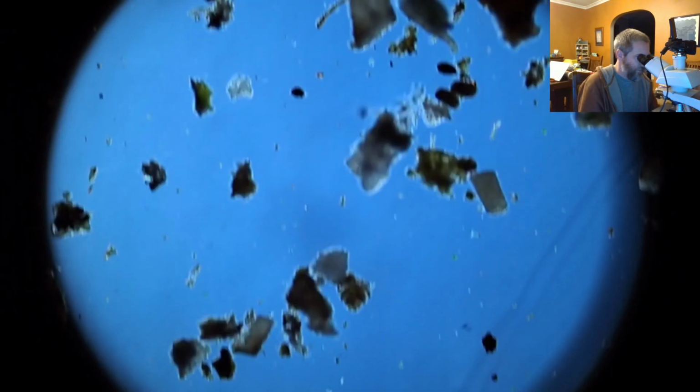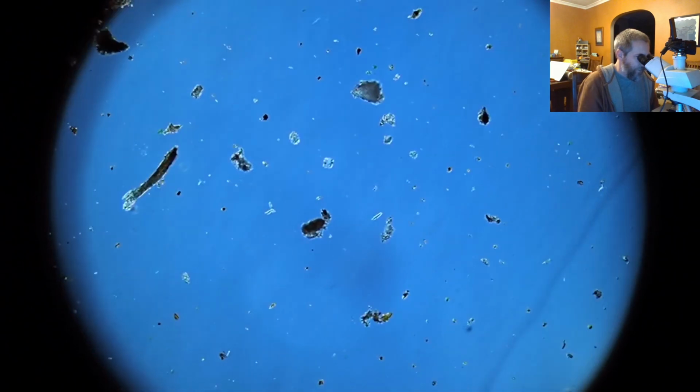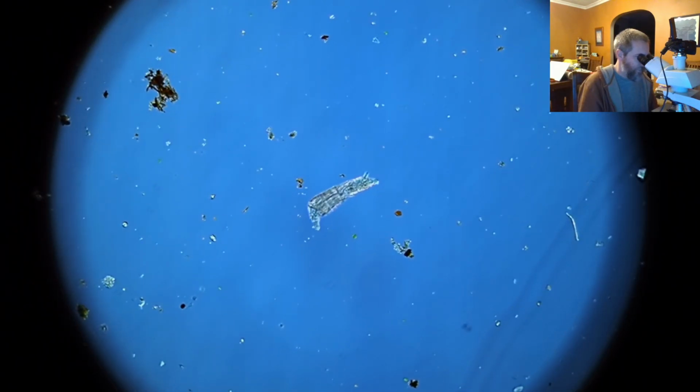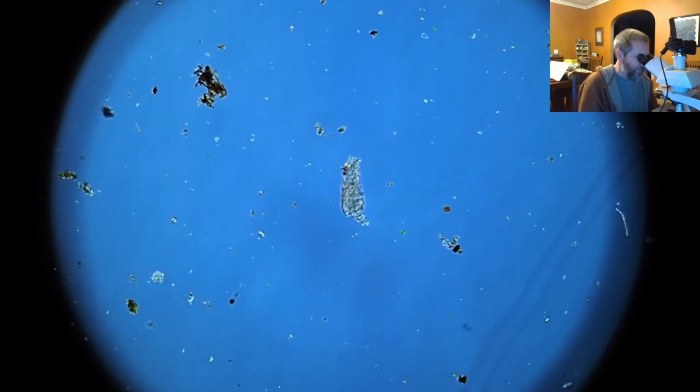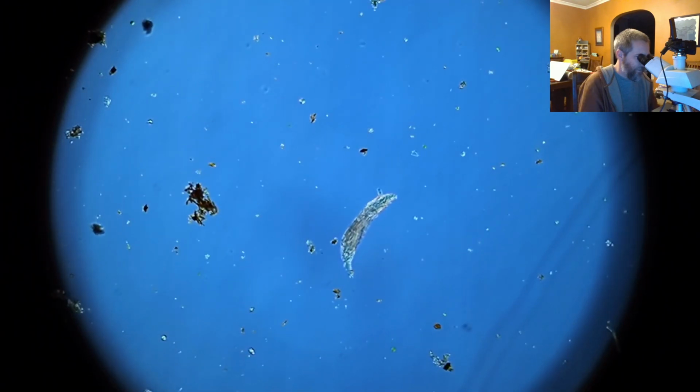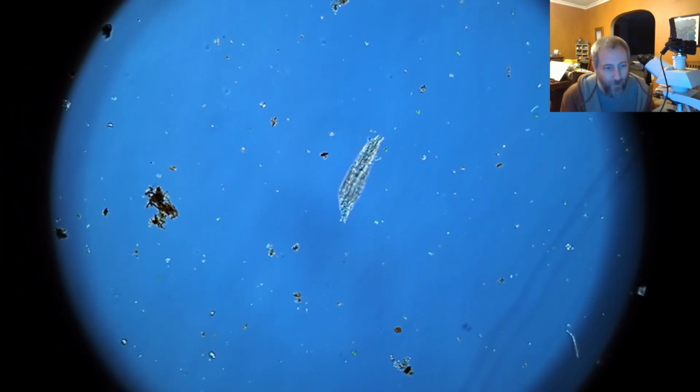No, I saw more water bears in here. Just seen like 3 of them so far. But part of the reason I wanted to hop on tonight and do a little bit of water bear streaming was because, oops, that's a rotifer out in the open. So you can see it crawling around and its little foot right there, and its little antenna, and then a little corona, sweepery mustache things.